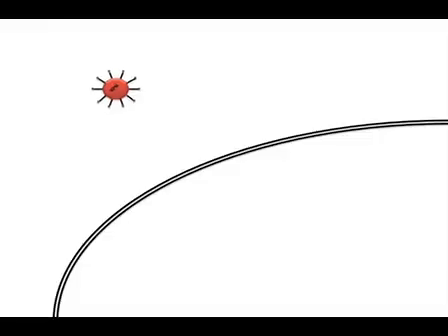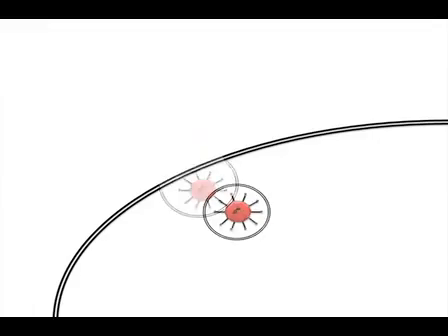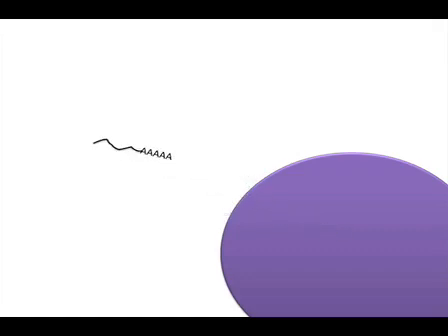When the virus is administered to the cells, it is internalized within an endocytic vesicle and transported to the nuclear envelope, where its DNA, including the transgene of interest, can penetrate the nucleus through the pore complex. The cellular machinery can then transcribe the injected gene and allow its protein products to act on the cell. In this case, the virally encoded Cre recombinase enzyme excises the floxed allele from the host cell genome.